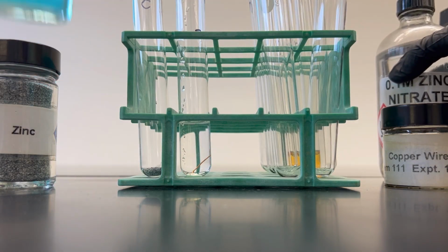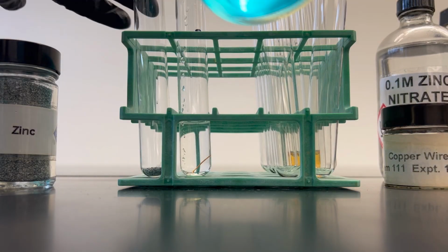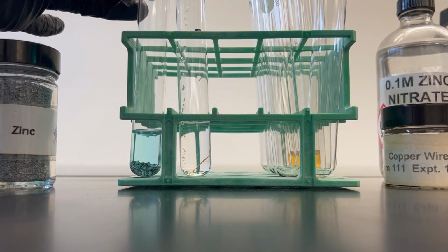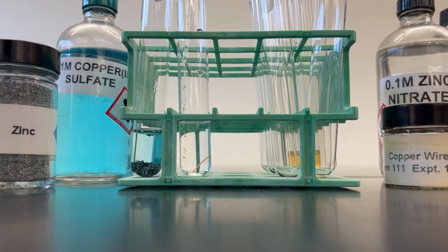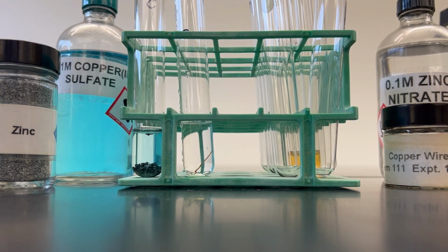And into the test tube with zinc, I'm going to add a small amount of copper sulfate. And now we're going to wait about 5 minutes for these to start to react.